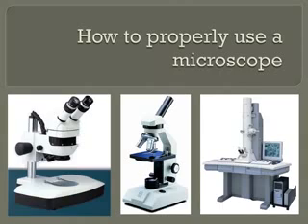Electron microscopes, as shown in the image on the right, work by using electrons to precisely map the surface of an object. These microscopes can be so large that they fill an entire room. They can cost tens to hundreds of thousands of dollars and are typically only found in universities or research facilities.